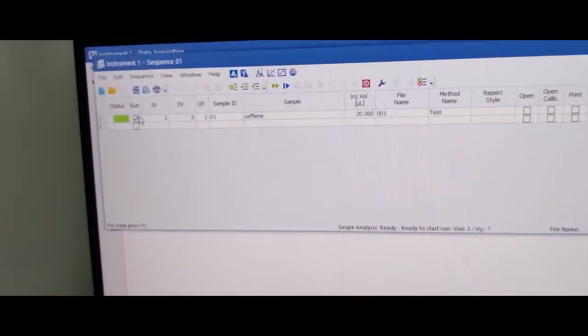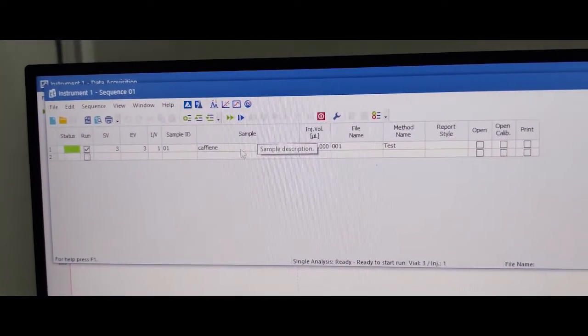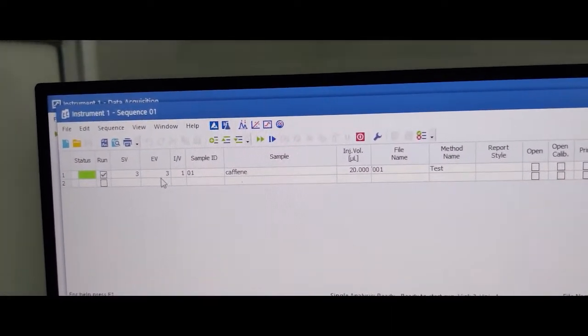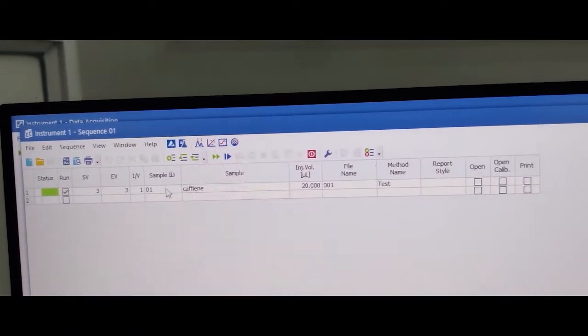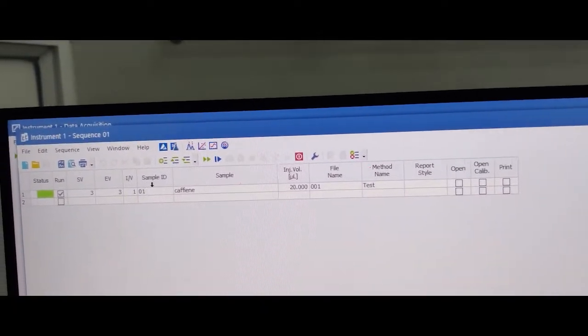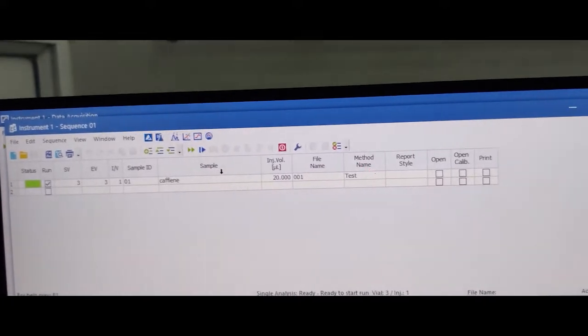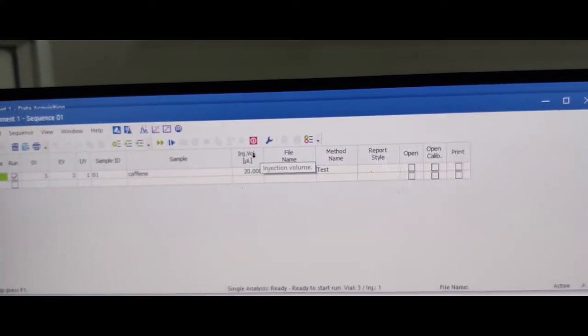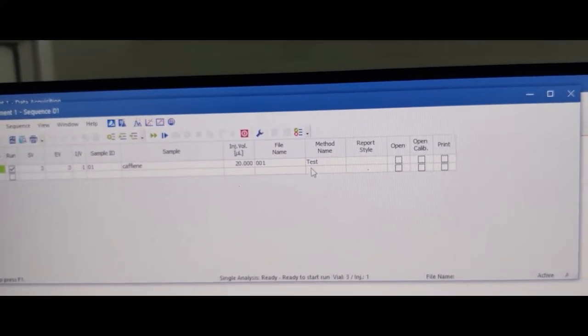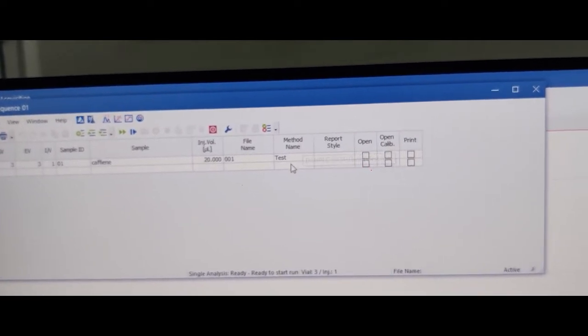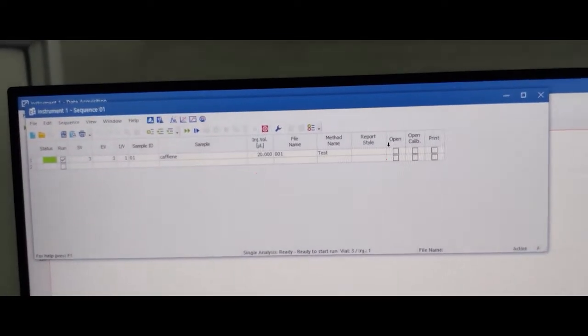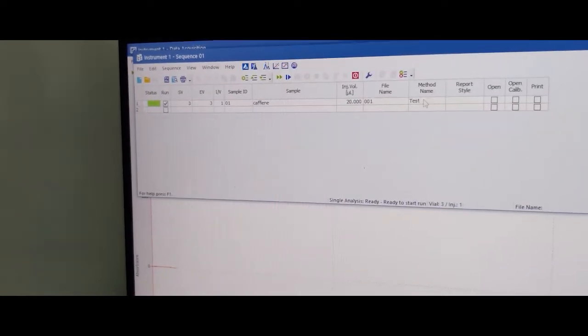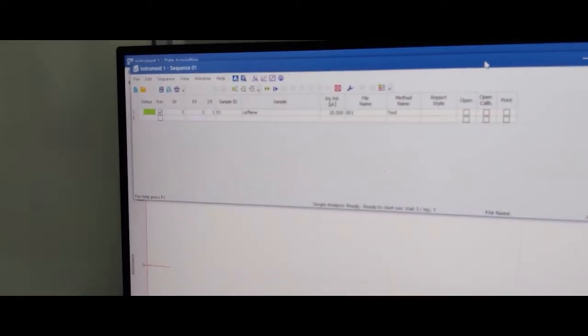Make sequence according to your sample vial number. Put the sample ID, sample name, injector volume, file name. Method already we sent. Now the sequence is ready for the run.